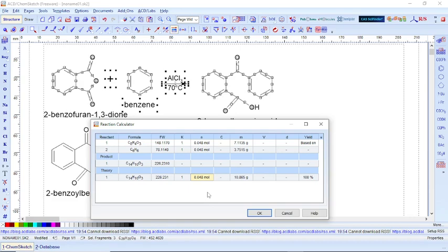of the starting reagent. So it is very easy and short for those of you who wish to work on synthesis, that before you move into your synthesis, you first calculate. This stage is the fundamental stage before you jump into synthesis. You need to know the amount of the starting reagents, because if you are doing a publication, you are going to state it in your publication.